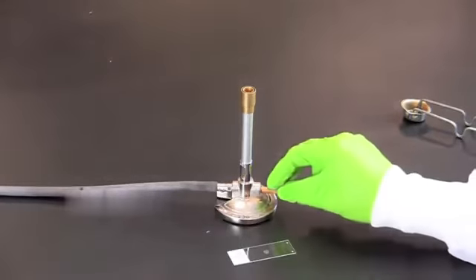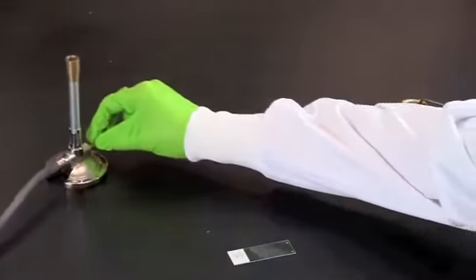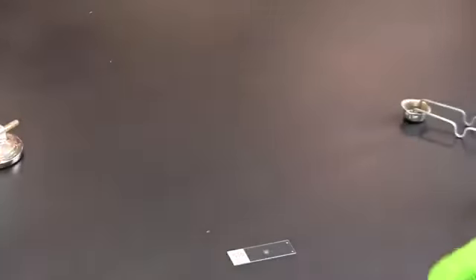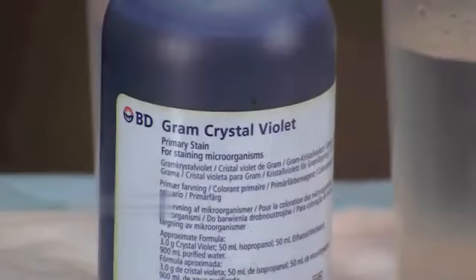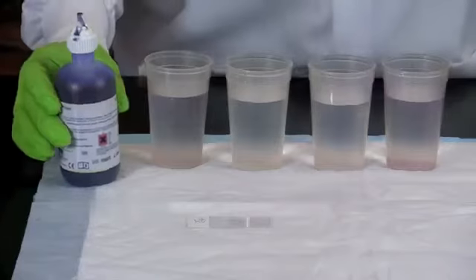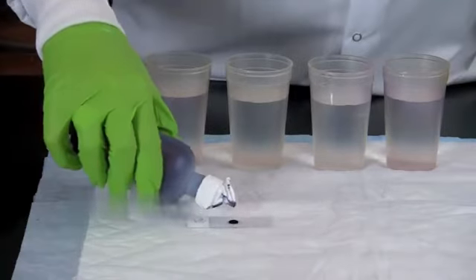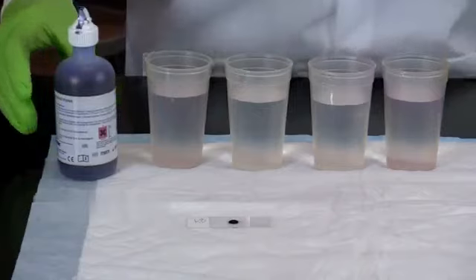Ensure that all Bunsen burners are turned off before obtaining the set of gram stains. The decolorizer contains a high percentage of alcohol and is very flammable. Add a few drops of crystal violet stain to the bacteria until the wax circle is filled with stain. Let this stand for 1 minute.